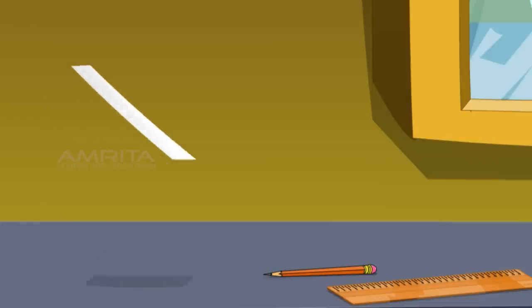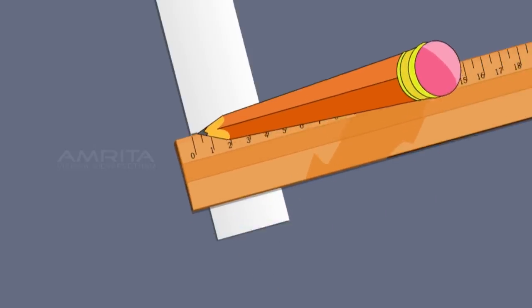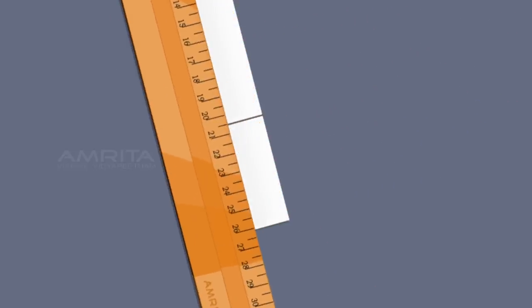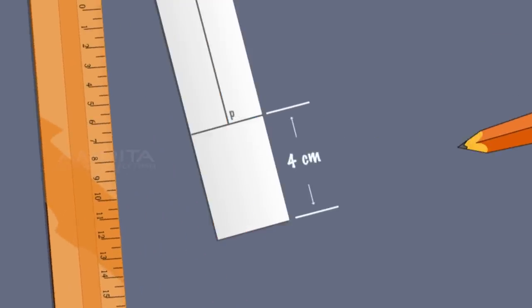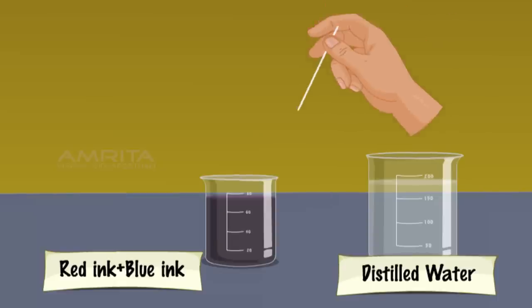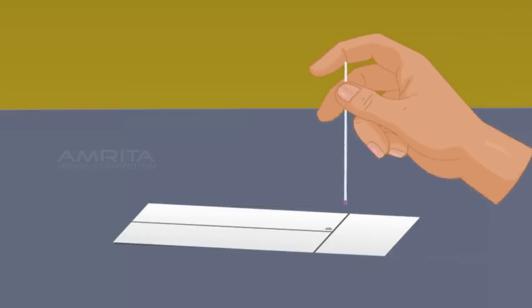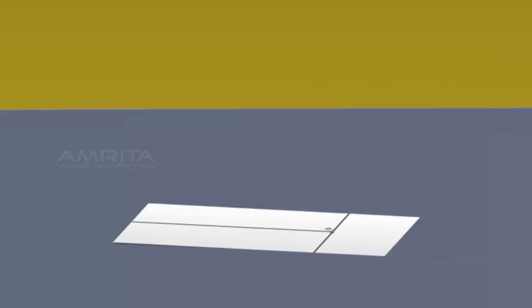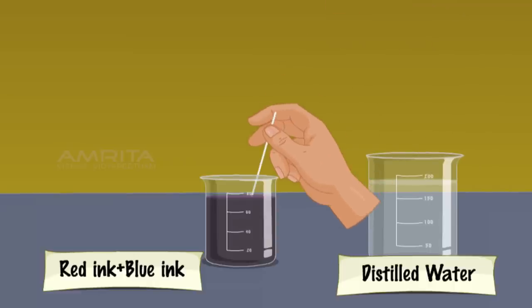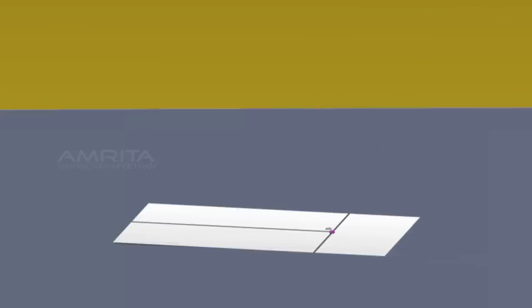Take a Whatman filter paper strip 20 by 2 cm. Draw a line with a pencil 4 cm from one end. Draw another line lengthwise from the centre of the paper and name the point at which the two lines intersect as P. Take a capillary tube, dip it into the beaker containing the mixture of red and blue ink, and take up the mixture. Put a drop of the mixture at point P and allow it to dry in open air. Again take the mixture using the capillary tube, put another drop on the same spot and dry it again so that the spot is rich in mixture.